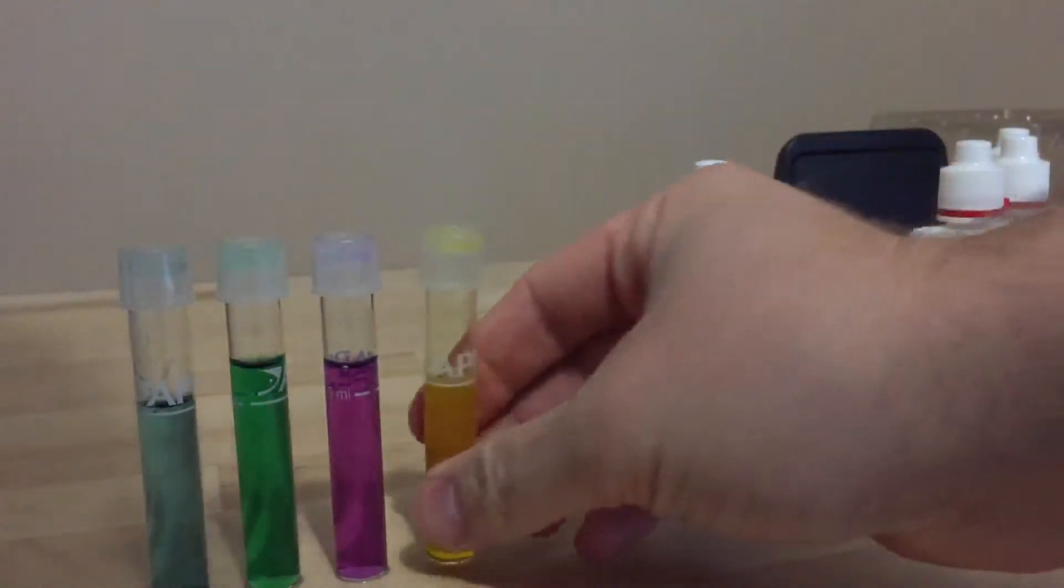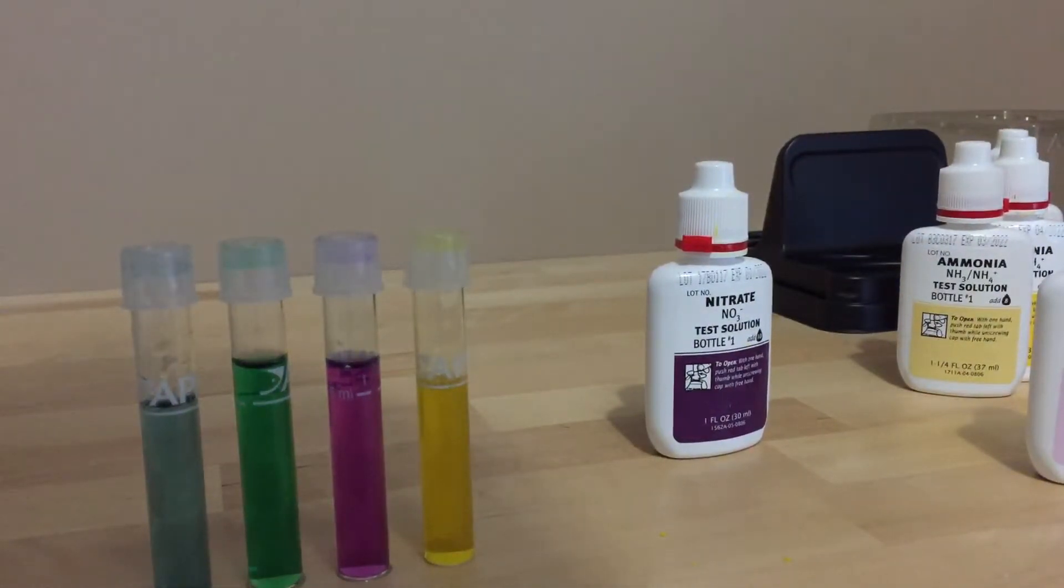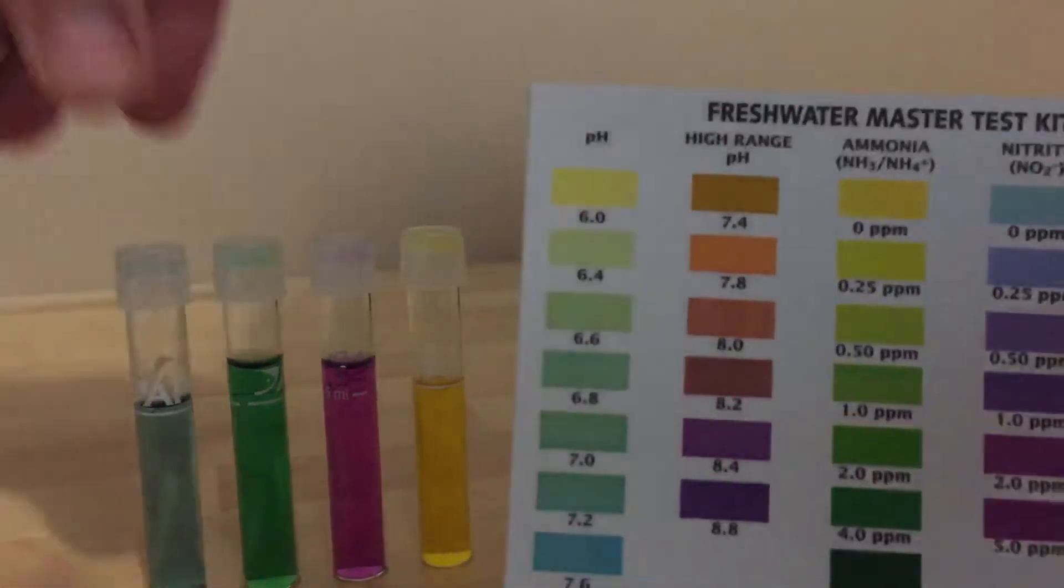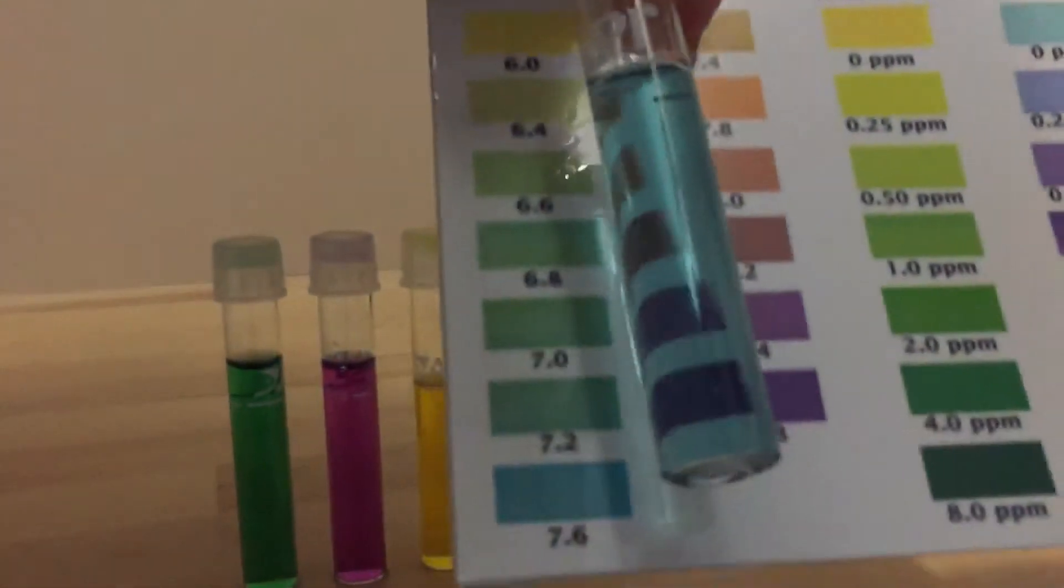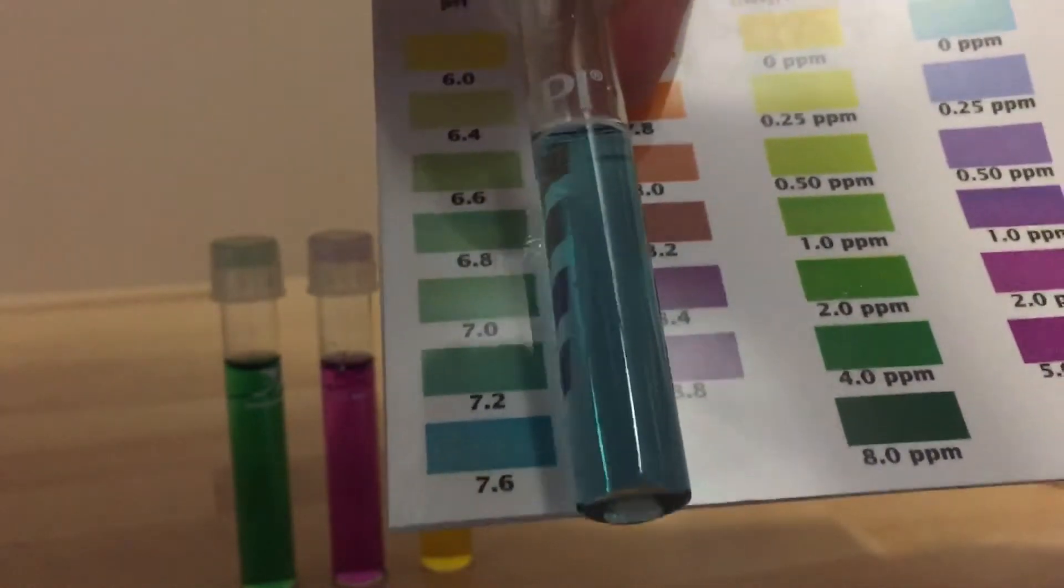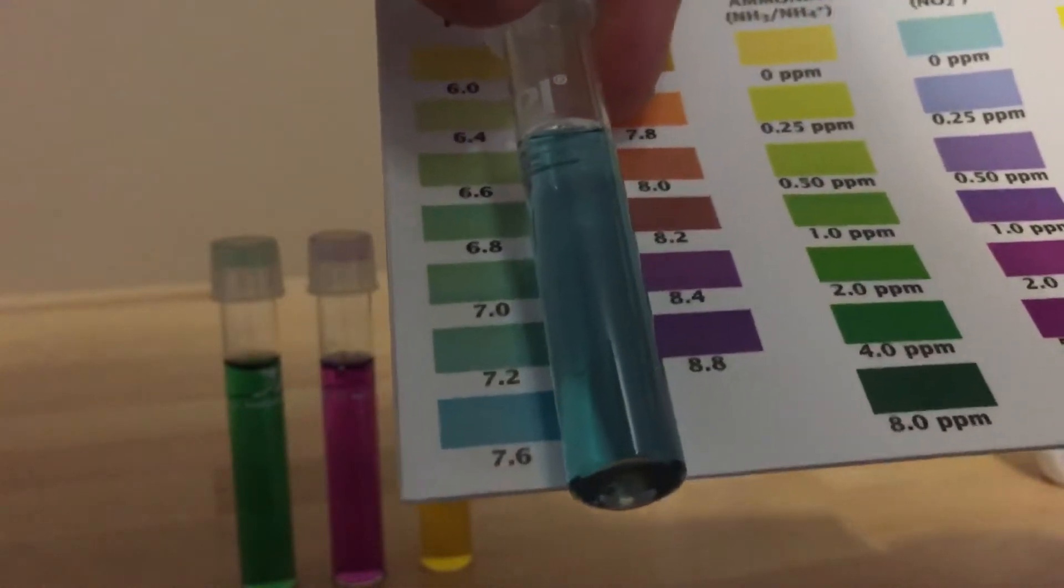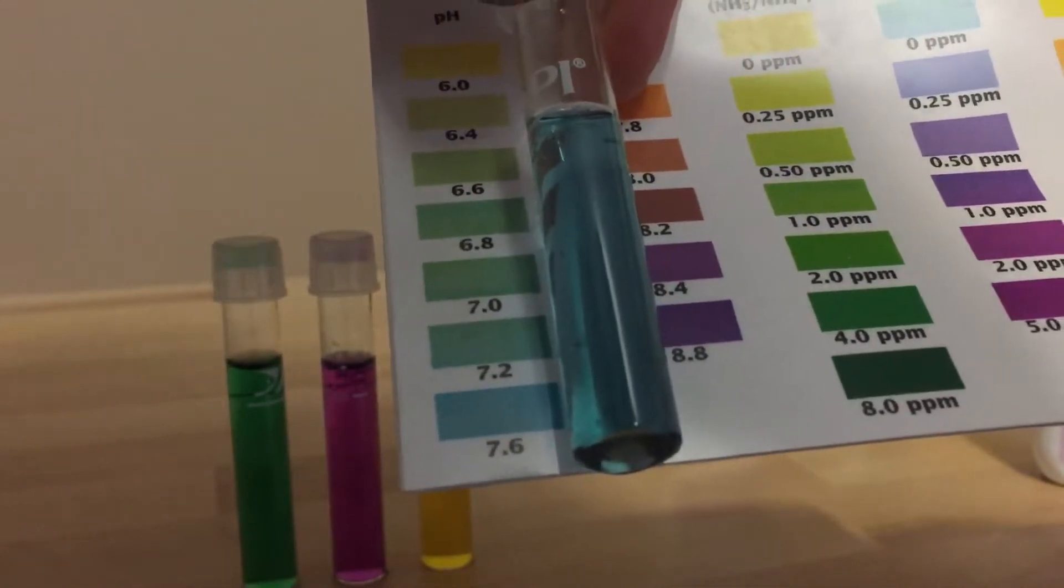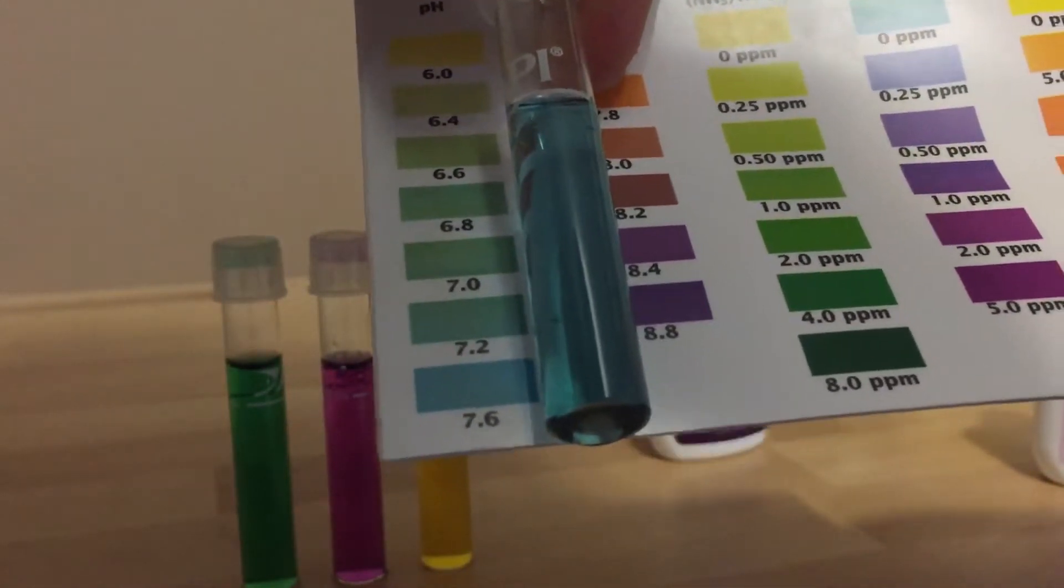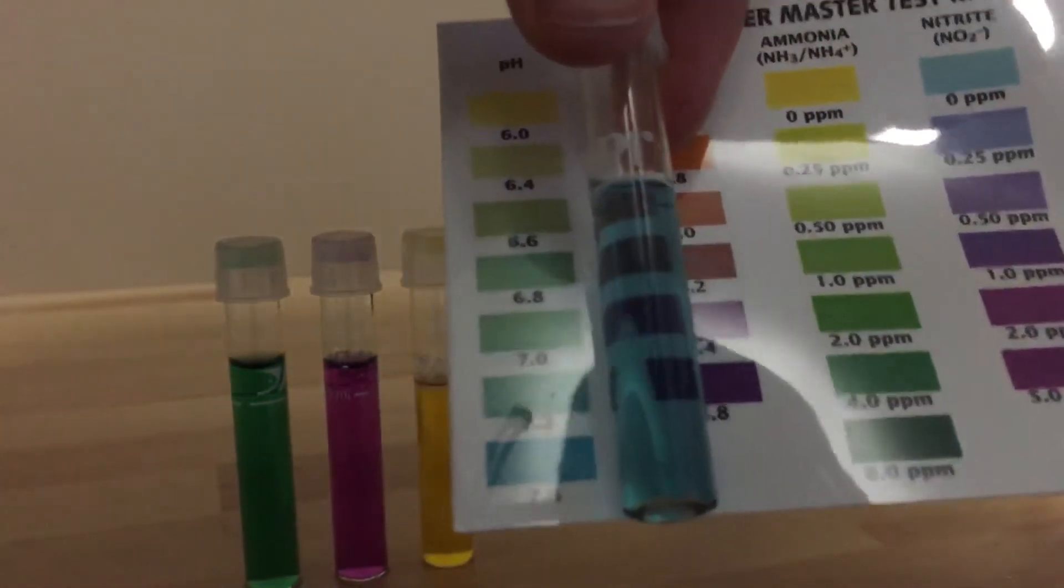So we'll see what turns up. So you can see the four test tubes have been sitting there for quite a while. So we'll start with pH. Again it's good to get into a well lit room. And if you look at this color here, you'll see that if we try to match it up on the chart, you'll see that it's around in between the 7.2 and the 7.6 on the scale, which is just slightly higher than the pH of 7 but nothing risky at the minute or anything to worry about.